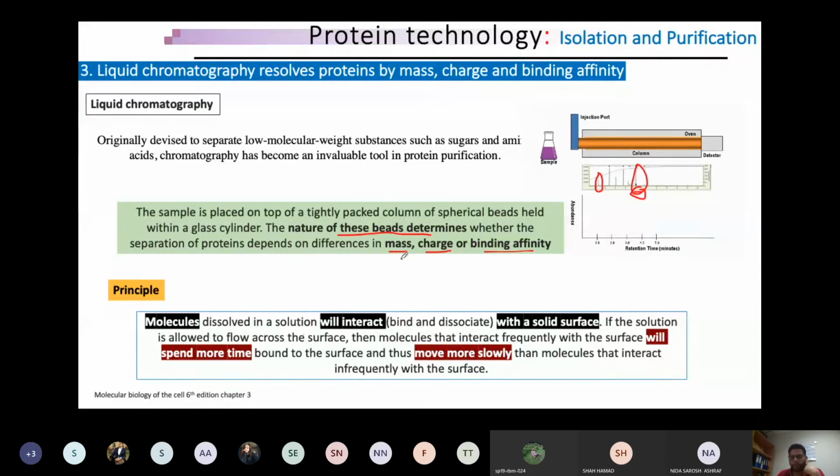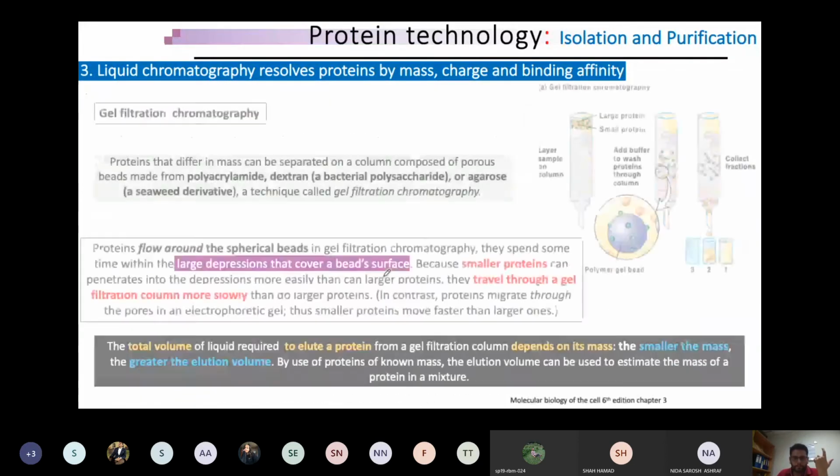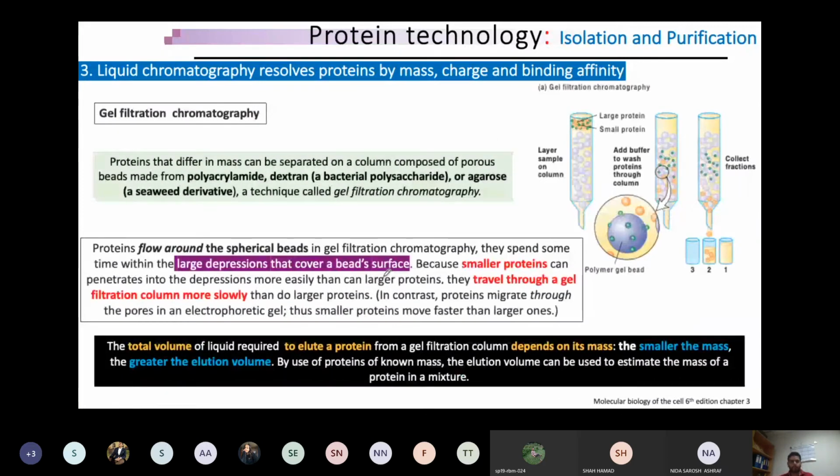So let's move on, so this will be easy to figure out. Okay, if you have a specific protein in your mind which has some specific molecular weight, you could use it, and such type of chromatography is called gel filtration chromatography. So that means you are filtering out through a gel, और अभी किसी ने पूछा इंटरेक्शन किस किस्म की है, अभी मैं उन इंटरेक्शंस की तरफ ही आ रहा हूँ.